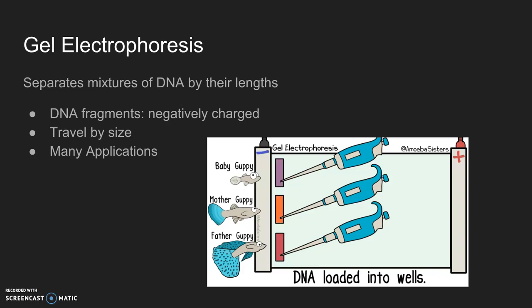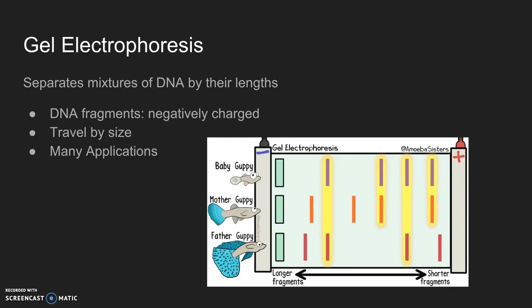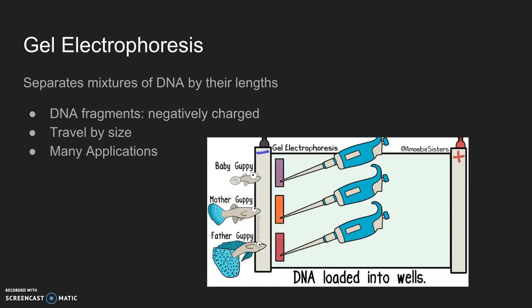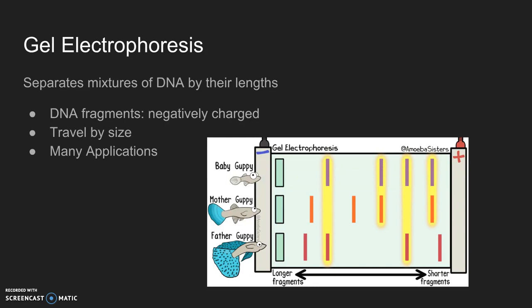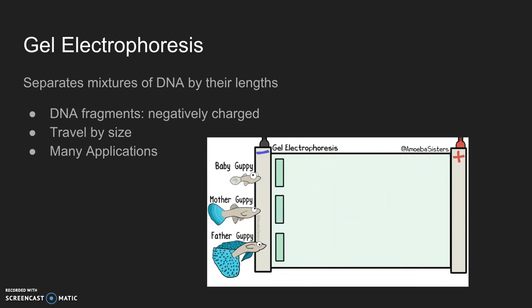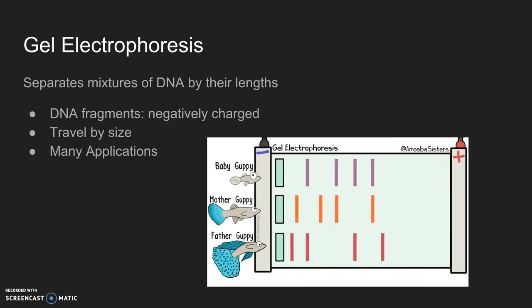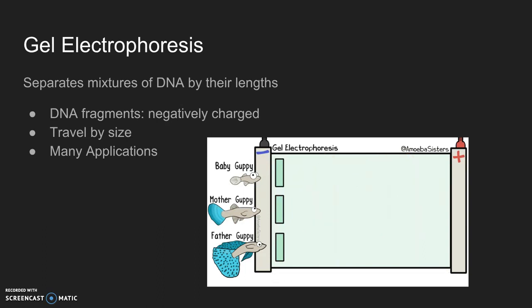When the electrical current is applied, the DNA will be attracted to the positive terminal of the chamber, because by traveling closer to the positive end, the negatively charged DNA will be reducing the distance and in turn making the potential energy more negative, by the equation that states potential energy is proportional to the product of two charges over the distance. Gel electrophoresis differentiates DNA molecules by size because of molecular structure.